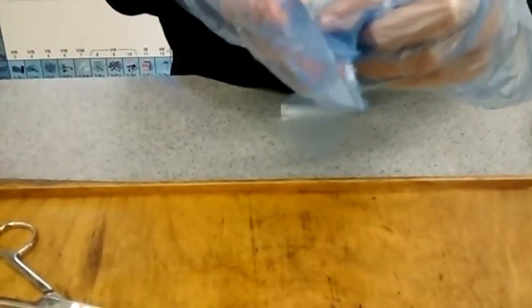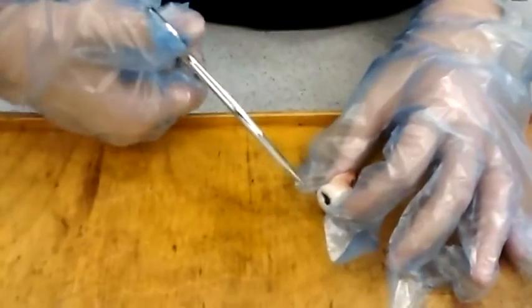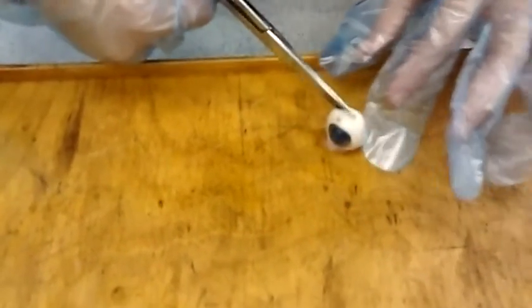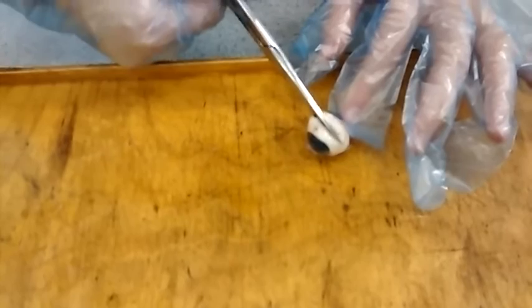Squeeze it and the stuff will come out. This is a hard thing to do. That looks really hard. If this squirts all over the camera it's just going to be like... Go on. Squidge harder.